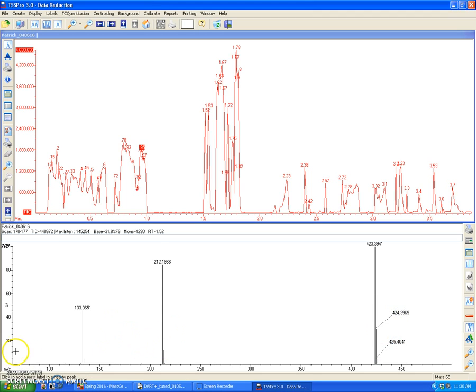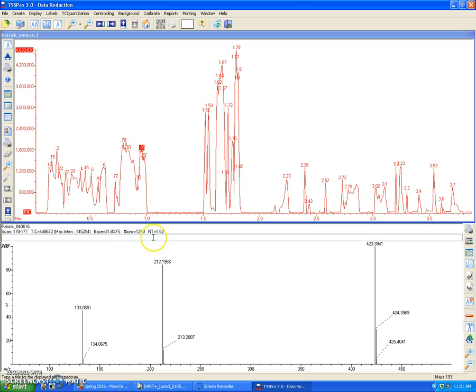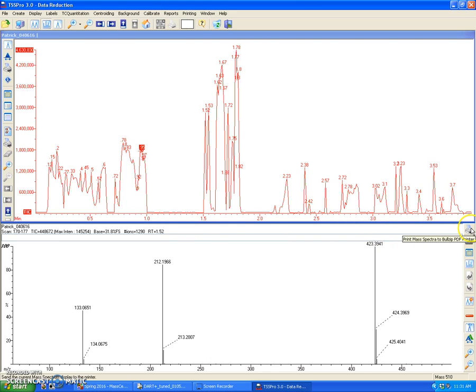Once I've labeled all the mass spectral peaks that I'm interested in, to print this either to a PDF or to a physical paper copy, what I will do is click on this button right here. And this will either be a 3.5 disk or a printer button. It doesn't really matter.